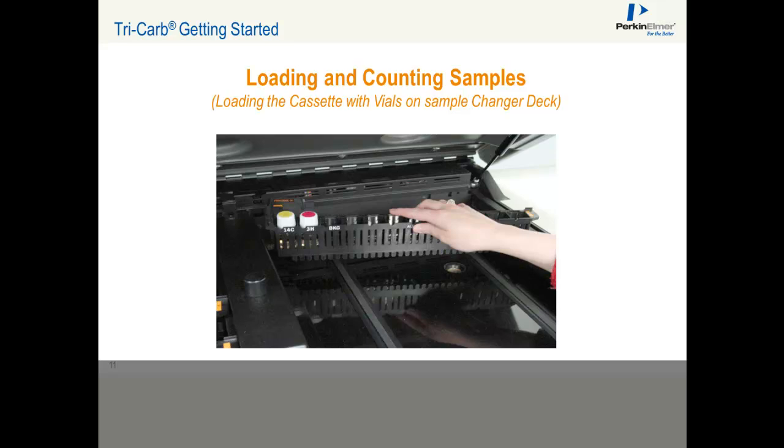When the protocol number is recognized, a reset flag indicates that the assay is being counted for the first time. The system will automatically set the flag after the cassette has been counted. Subsequent counting of the protocol is considered to be the following cycles of the same samples. You should reset the protocol flag each time that you put new samples into the cassette.